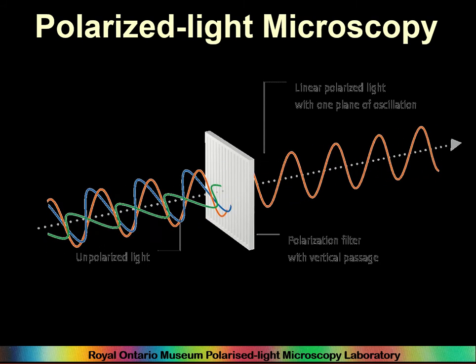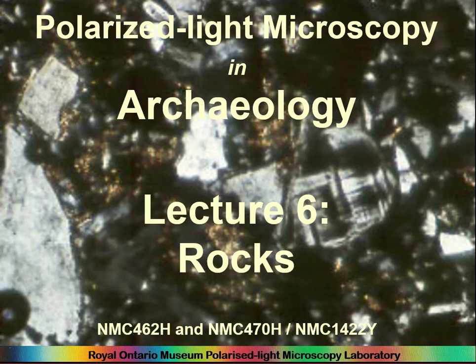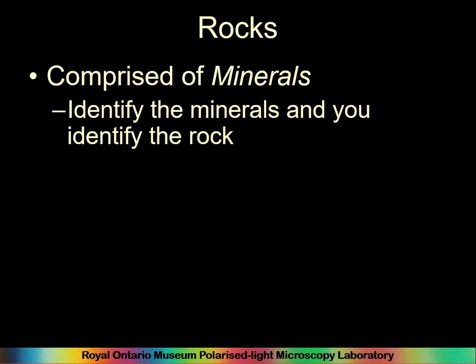Polarized Light Microscopy in Archaeology. And this is Lecture 6, the real Lecture 6 this time: rocks. So rocks are very important. In petrology, we may study rocks of various sorts, and we may, of course, find rocks in pottery.